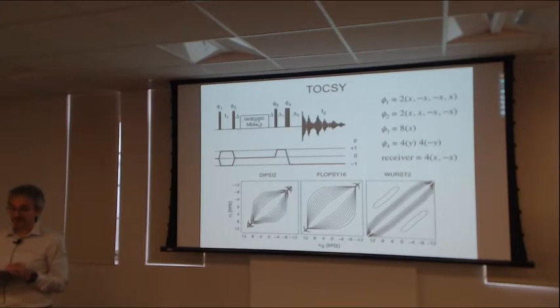If you want to get transfer further out into the spin network, this might be as large as, say, 70 or 80 or even 100 milliseconds until you run out of signal because of T2. There are going to be losses in here from what's called T1 rho.